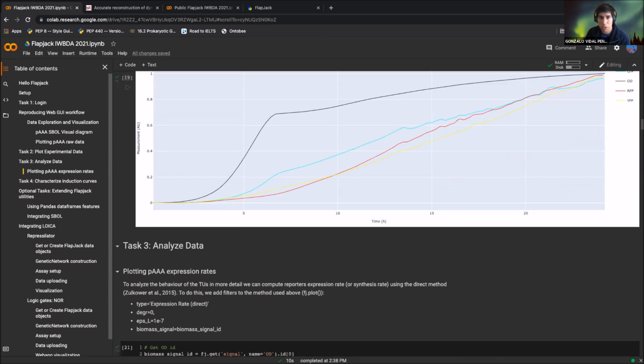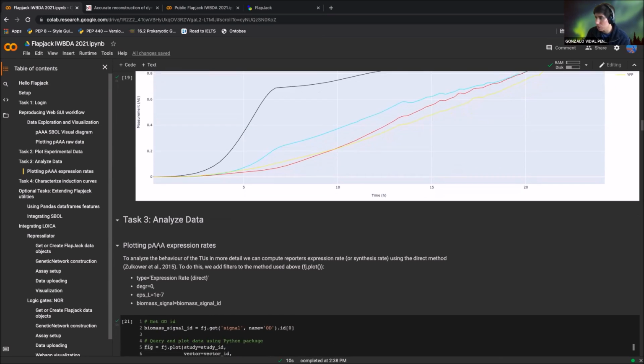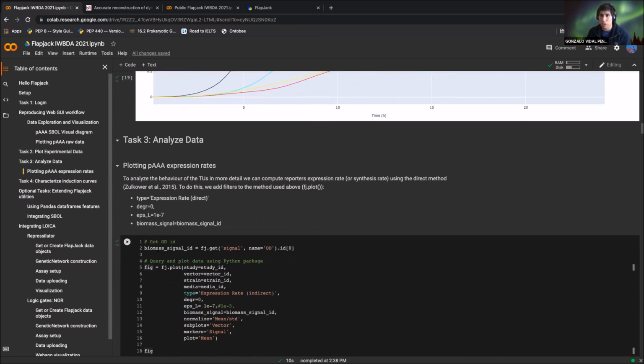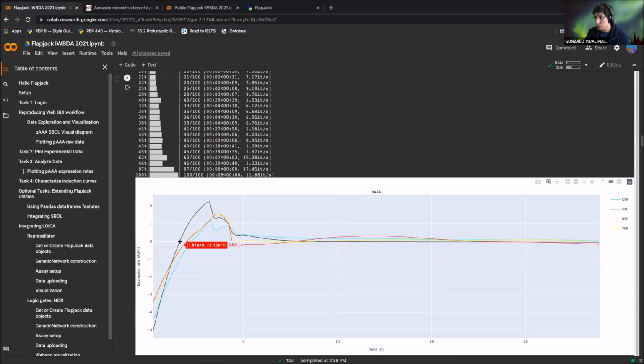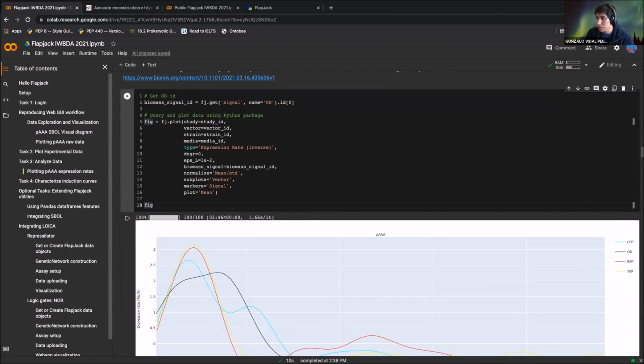Okay. So yeah, good question, Alex. And I think we're on the same page about calibration. It's pretty much needed if we want to move to work collaboratively, because one of the major aims of Flapjack is to allow researchers to generate data and work together. If we advance separated, we can do fewer things. If we can work all together, my data is comparable with your data, and they can be compatible and even complementary in order to extract new information.